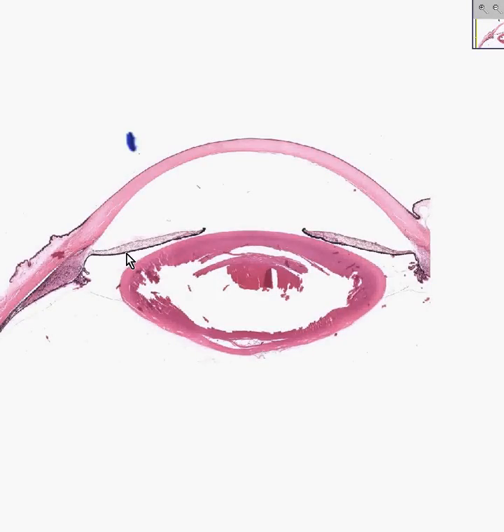In this particular slide, you may occasionally get the feeling that the tissue is looking at us rather than us looking at the tissue because, as you can see, this is an eye. Here is the lens of the eye, which is a little bit fragmented due to having to try to cut this very crystalline-like substance, but it is still one of the best slices of eye I've ever seen in my life.